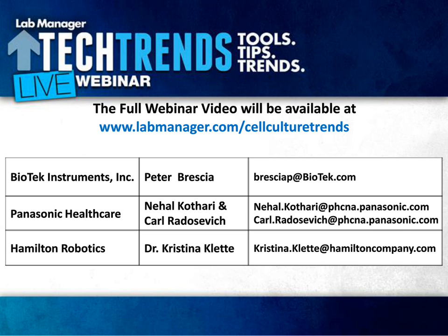I can add a piece to this. As I touched upon in our presentation, the equipment is out there, but I think a trend in general cell culture will be to drive the physiological oxygen idea. There are a lot of different methods you can use.